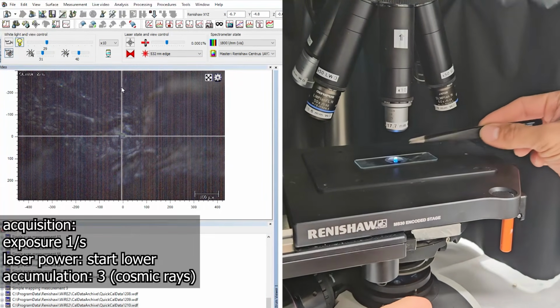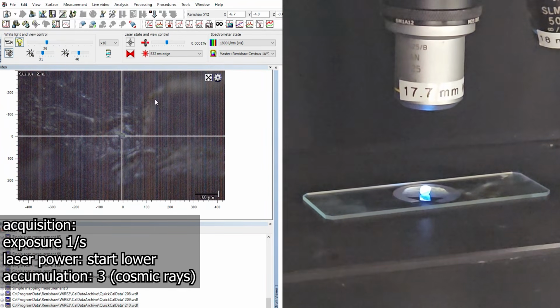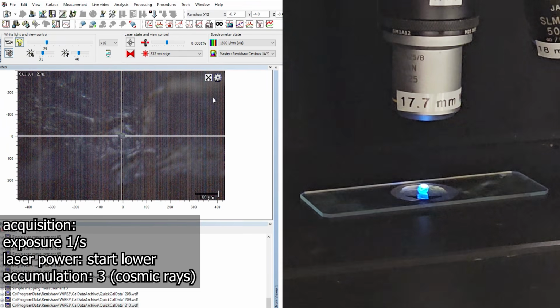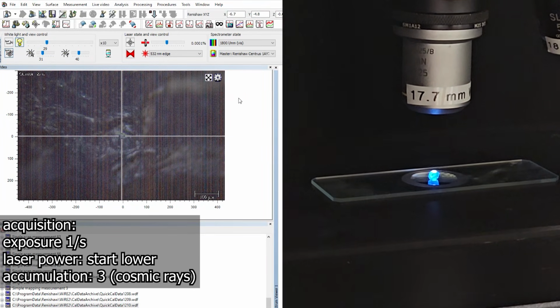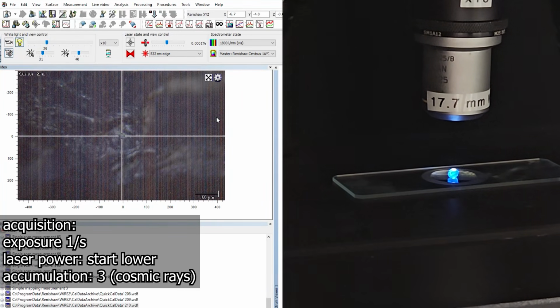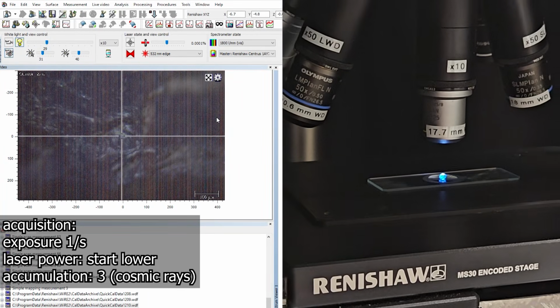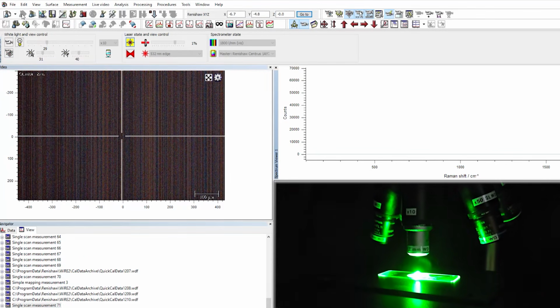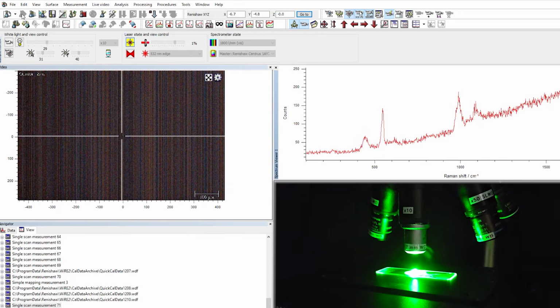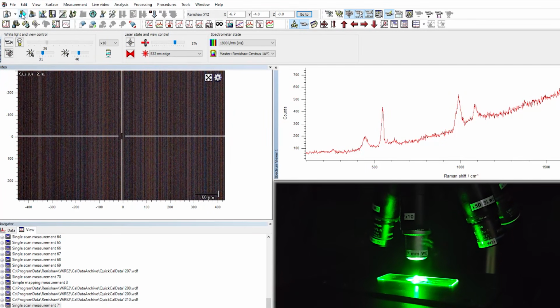It's a good precaution to slightly reduce the laser power to avoid burning away parts of the crystal. The system will now record this 3 times. This specific setting is actually quite important, and here's why. If cosmic radiation happens to interact with the detector during that 1 second measurement, a very sharp peak will appear. By recording multiple scans, in this case 3, you can easily have the software automatically filter out such anomalies, because that specific event is highly unlikely to reoccur during the other measurements.